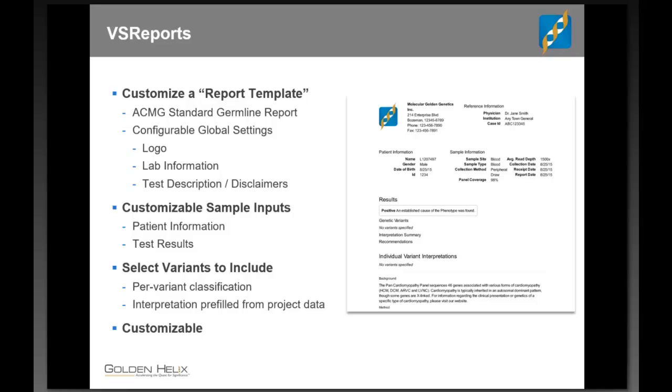But if that's not where you want to spend your time, again, with our solutions is a whole lot of customizability and services, and we can configure a service to, say, build 3 different reports where we sit down with you, understand those report requirements, and prototype them and iterate on them until you have a report that looks and performs the way you need for your setting.